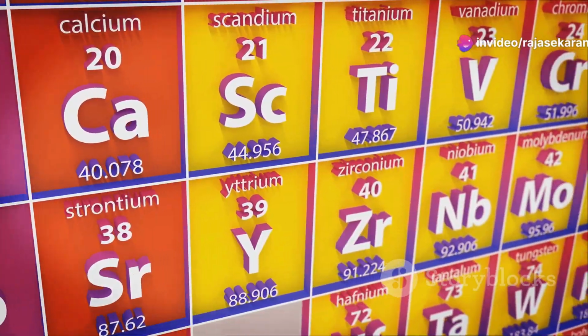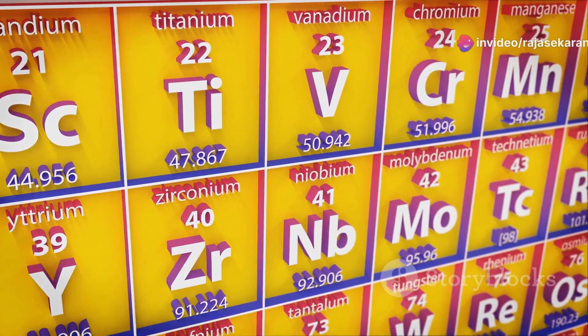Each element in the periodic table produces X-rays at unique energy levels when excited. Think of these as the element's unique fingerprint. By measuring the energy of the X-rays emitted by a sample, EDS can identify which elements are present.